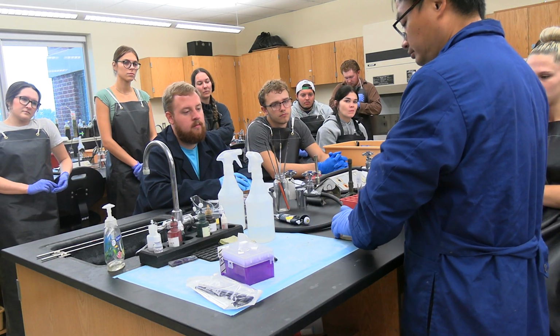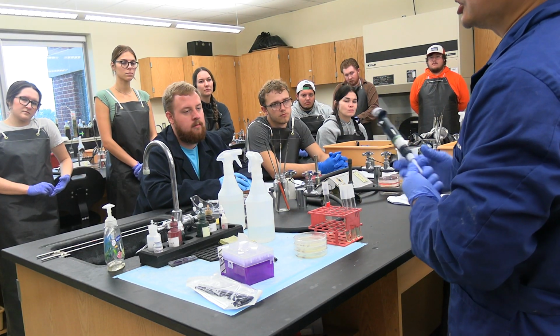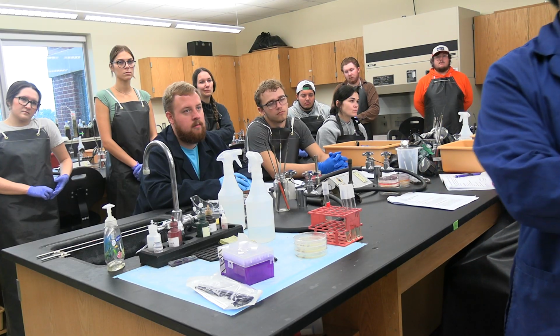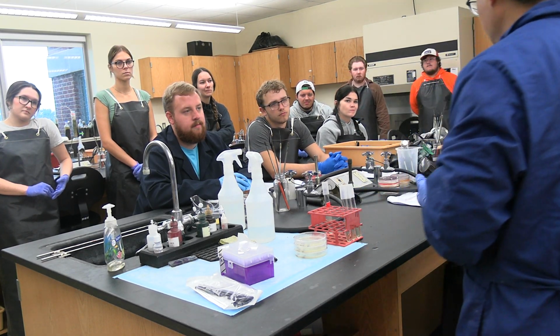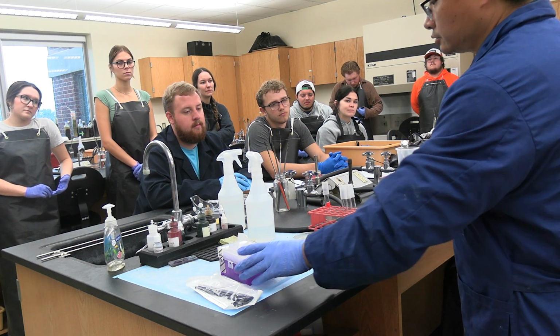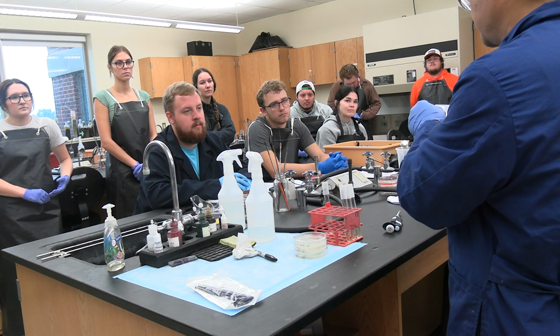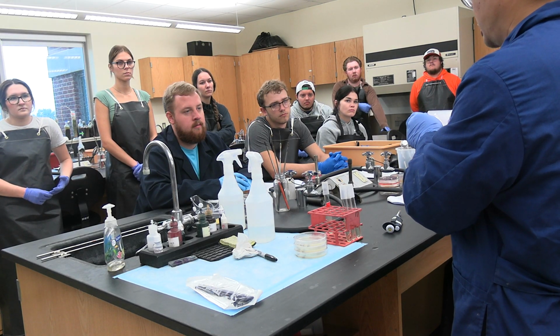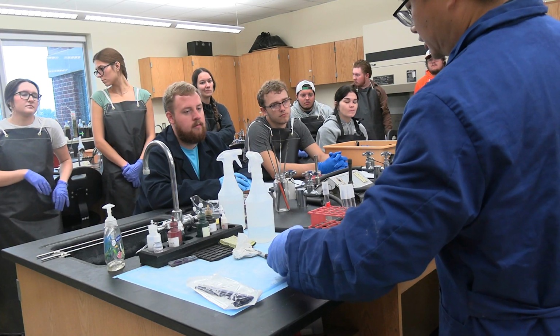Okay? Now the other things. We want to make sure this pipette is at 100. Sorry, make sure it's at 100. Sometimes people don't see it. Maybe at 50 you start to do it, then it's not going to be accurate. And also the tips, make sure this is a 200 microliter tip, not those big ones. Those big ones are for 1 ml tips. Okay? These are things already set.